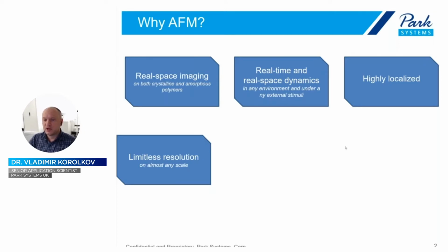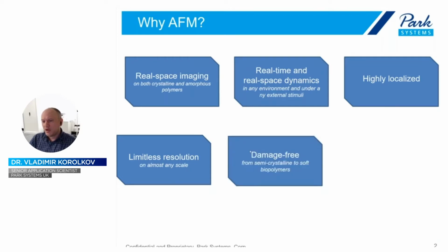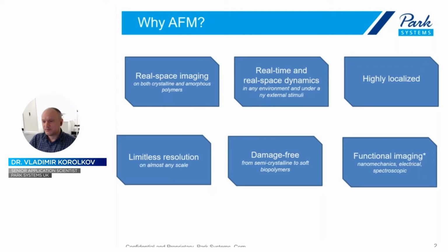So in principle, depending on the equipment and depending on how you do it, you can go down to seeing atoms in molecules on certain systems, and that has been demonstrated. It is also a damage-free technique, so you don't need to destroy your sample to get an idea of the structure. So you can assess everything from extremely soft and delicate biopolymers all the way to very hard crystalline surfaces. So again, any sample pretty much.